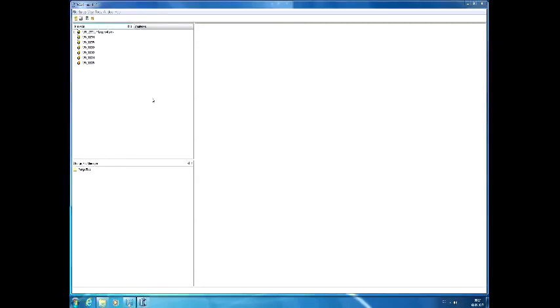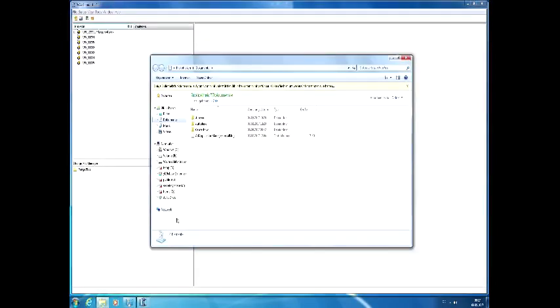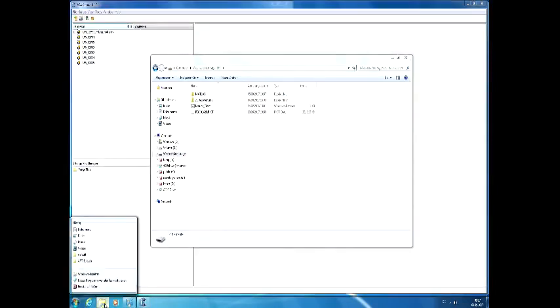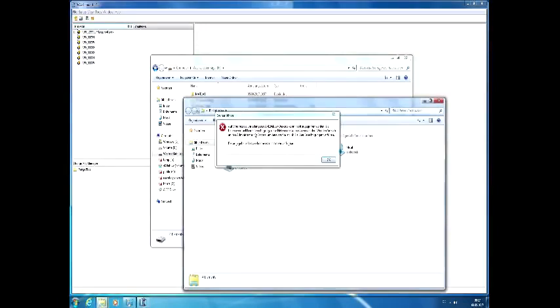We're going to straight away do it with a data set that was provided by Chandra. What data is it? Or don't tell me. We'll find out along the way, because we always say atom probe is something where we don't need to know beforehand what stuff is. We'll find out whether that's actually true or whether it's just wishful thinking. Let's put it this way.